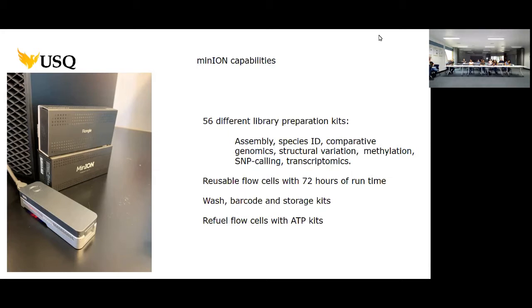So this means that if for some reason you've overloaded a flow cell with DNA, transporting that DNA down to the nanopore and translocating it through requires energy. And so if you overload a flow cell, you might find that you're going to deplete the energy that's available, and that translocation is going to drop right off. And you'll see that in your quality data while you're running it.